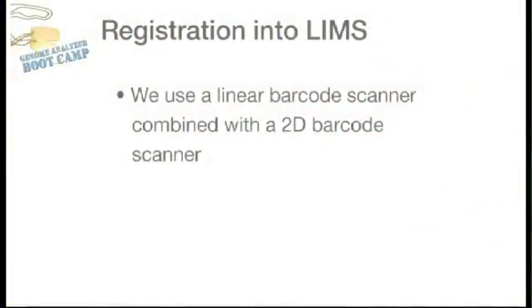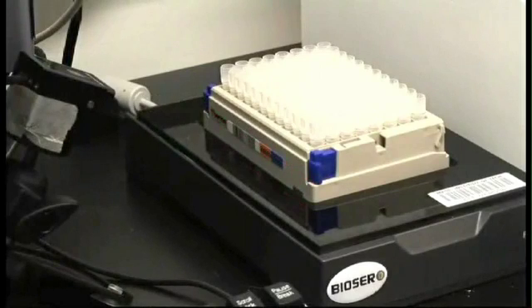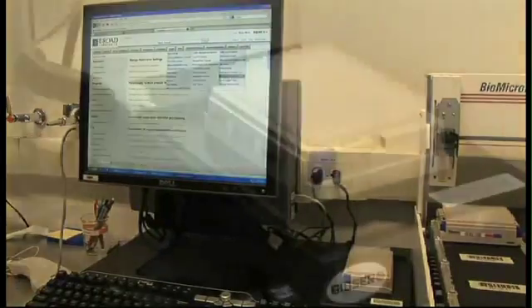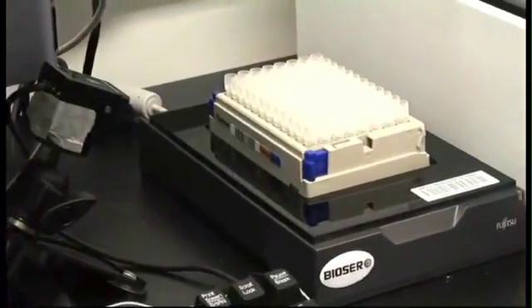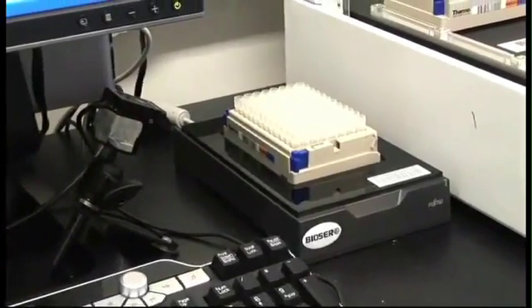After the samples have been cleaned up using SPRIselect, we will register the samples into our LIMS database. We do this using a linear barcode scanner combined with a 2D barcode scanner. By putting a linear barcode on the 2D bar-coded plate, we can track where that full plate goes through our LIMS system. We select the appropriate command in LIMS, the scanner scans the plate, and once scanned we can fill out all desired information such as volume and concentration.